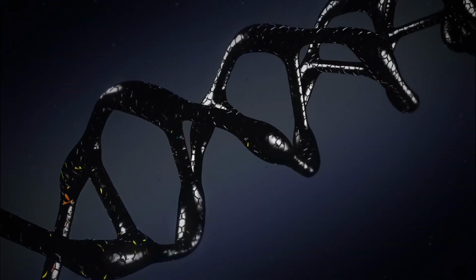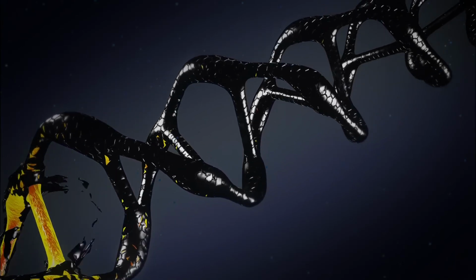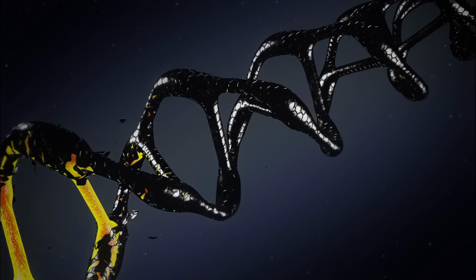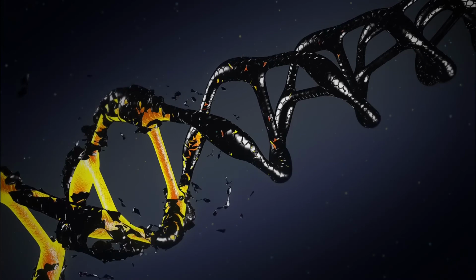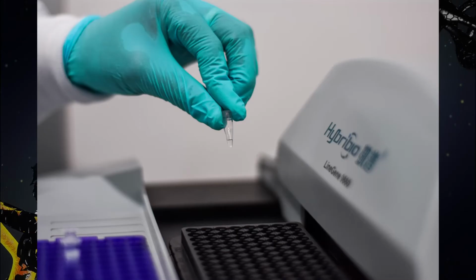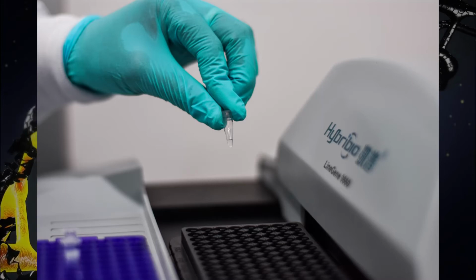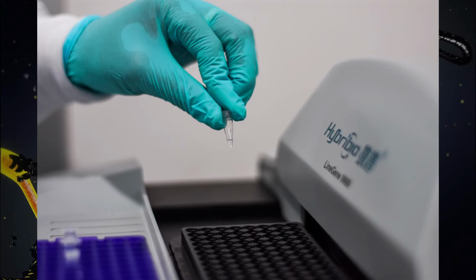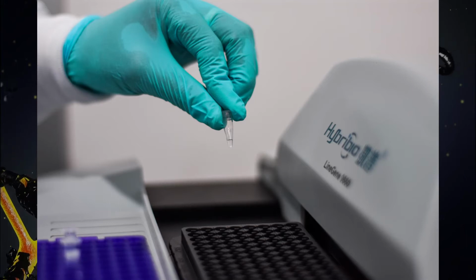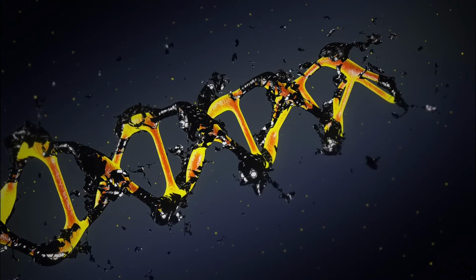If, rather than getting multiple possible genes or data out of a single sample, you're focusing on a single particular gene, but one that is large, you should look at nested PCR. Nested PCR uses several repeated rounds of the polymerase chain reaction. But what you're looking to do is to extend one gene that's quite large, and it requires two pairs of primers. This will generate a large DNA product in the end.